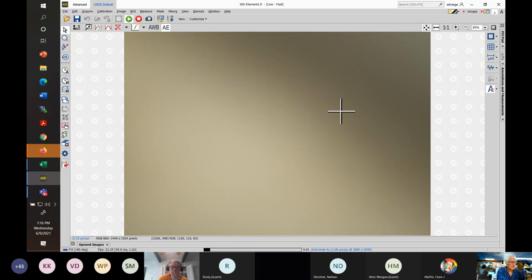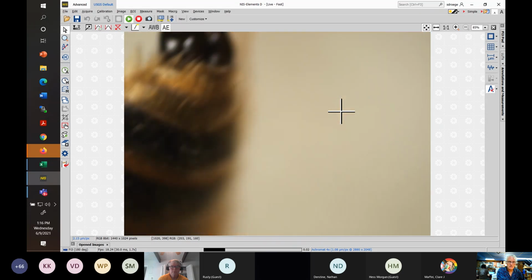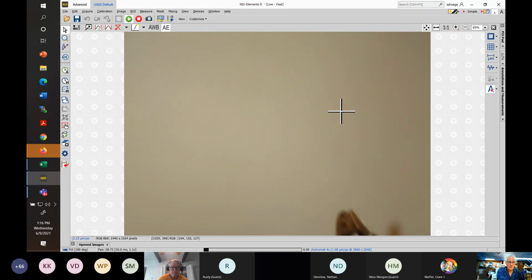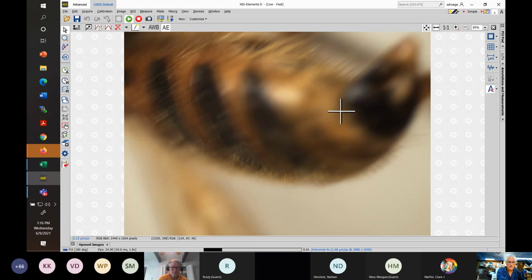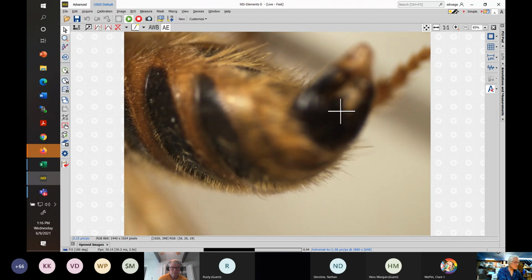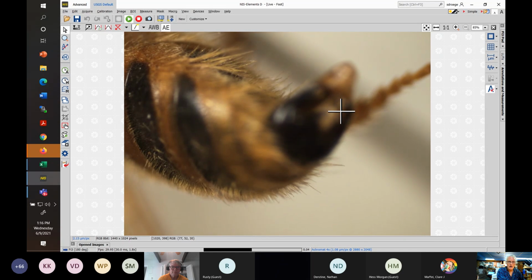And now we're going to go to S8. So sternal, I'm going to take off the label here. Sternal segment 8 is an important one in Andrena, but largely never used in other species. So first of all, just some more orientation.